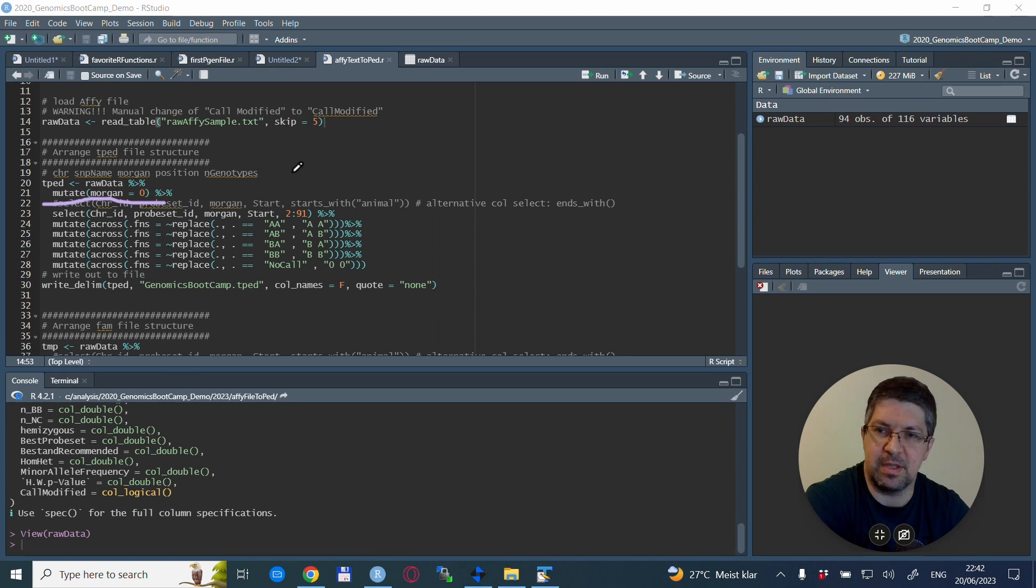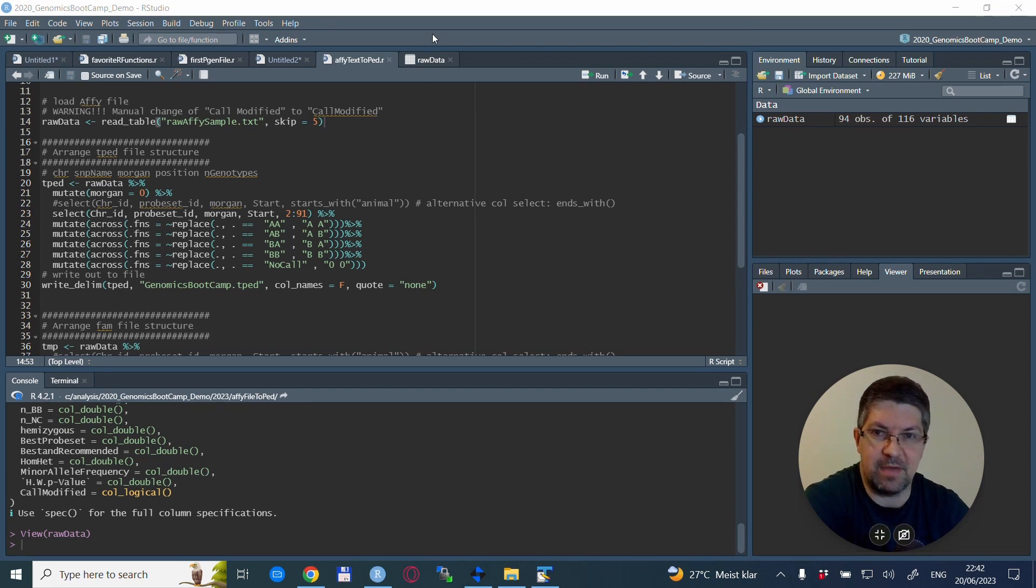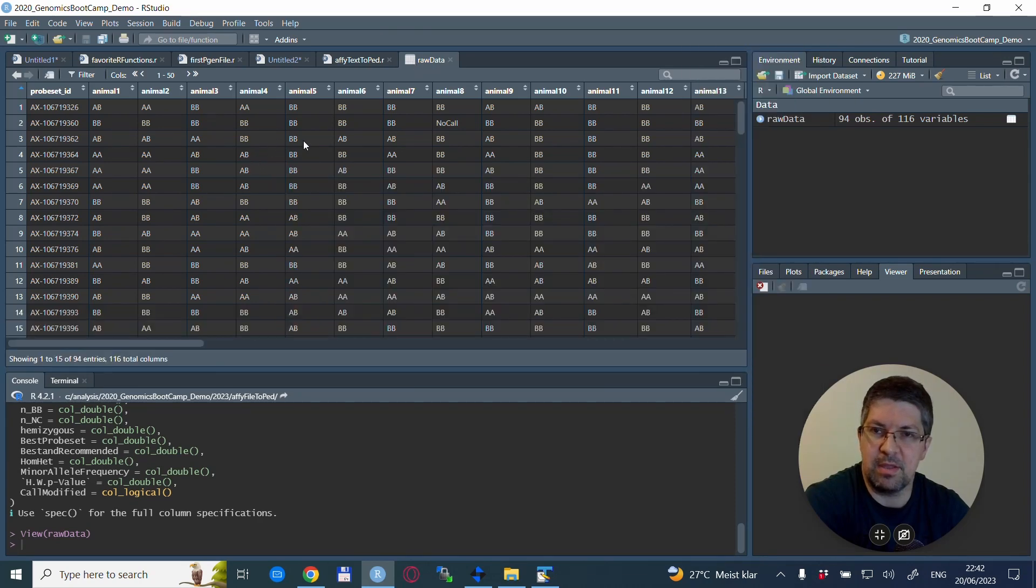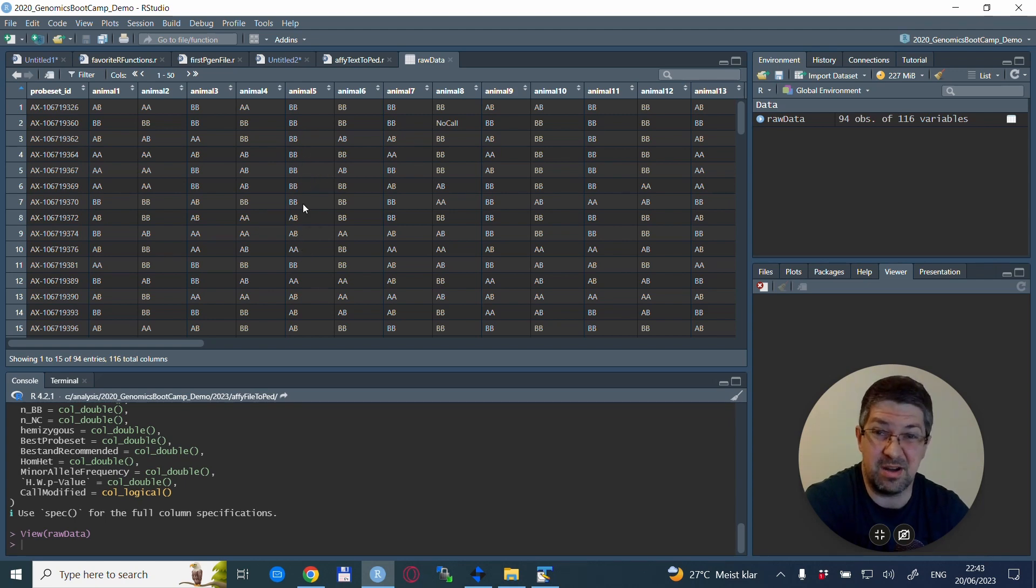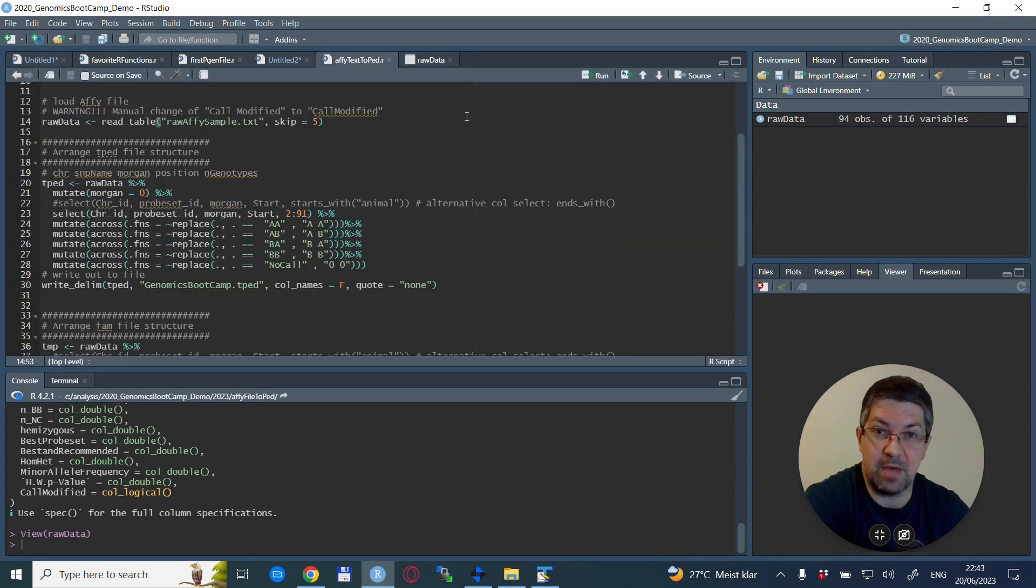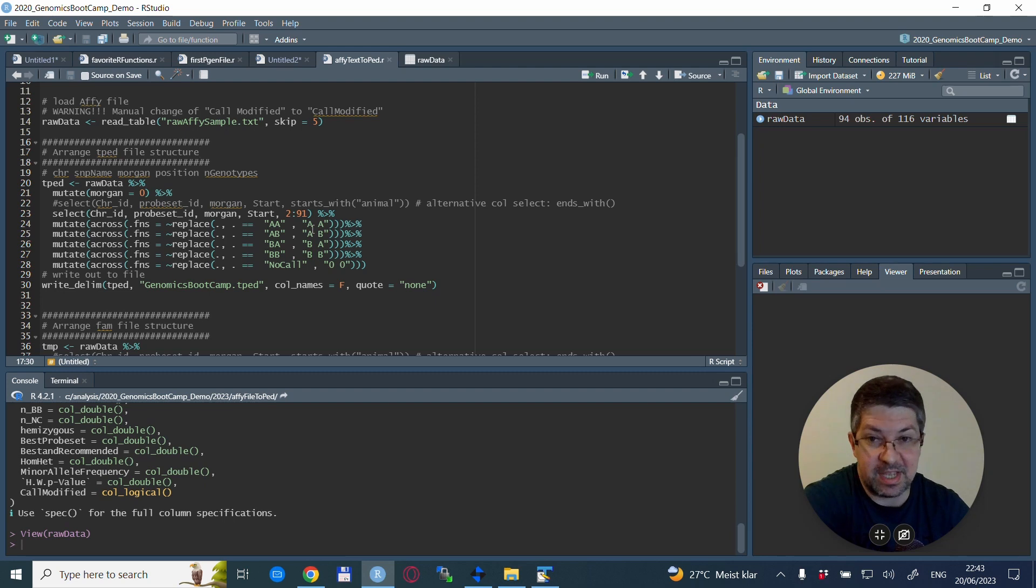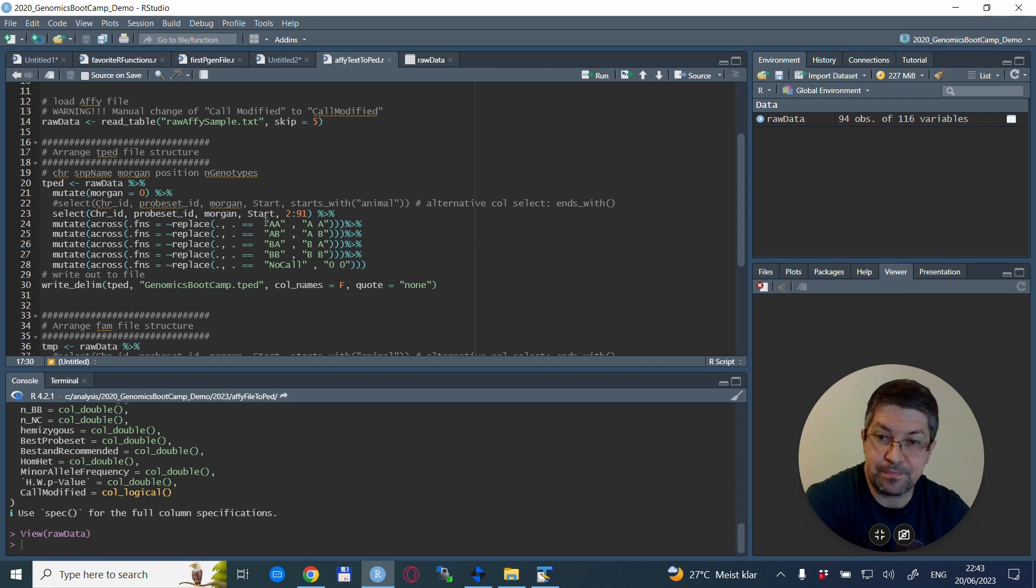That is the chromosome, the SNP name, the Morgan position, and column number four is the base pair coordinate of that particular SNP. So these are the first four columns for the tped file. And then we need 2n columns that are the alleles for each of the individuals. So this is exactly what we are going to do. We do not have a Morgan position right now, but we create that with a mutate statement, and we just put all the Morgan positions to zero.